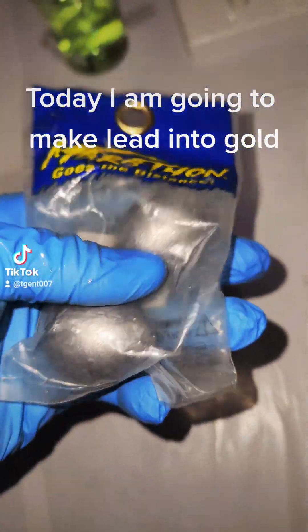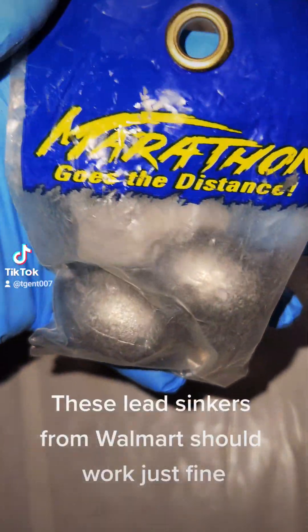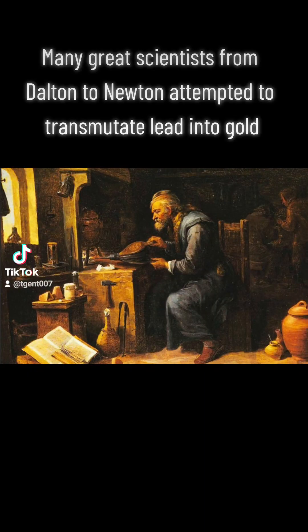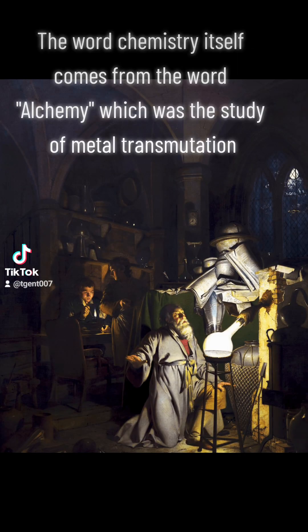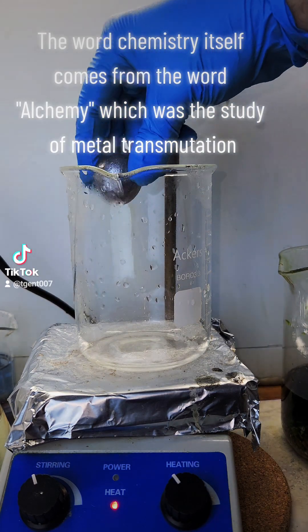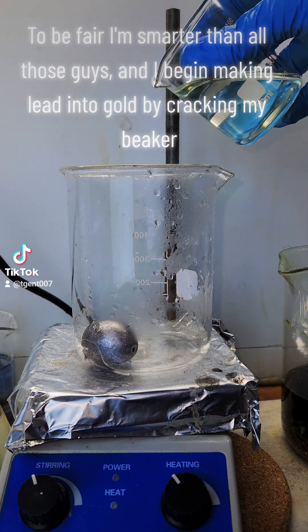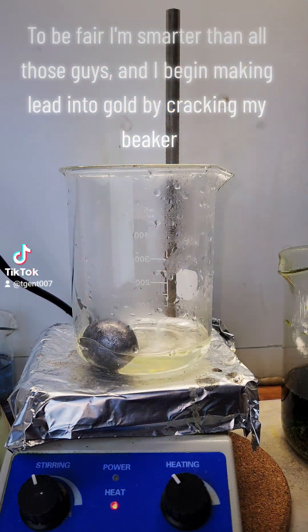Today I am going to make lead into gold. These lead sinkers from Walmart should work just fine. Many great scientists from Dalton to Newton attempted to transmutate lead into gold. The word chemistry itself comes from the word alchemy, which was the study of metal transmutation. To be fair, I'm smarter than all those guys, and I begin making lead into gold by cracking my beaker.